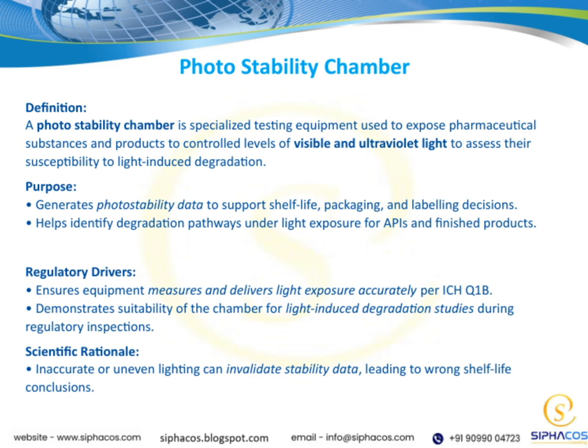These are crucial because they ensure our equipment measures and delivers the correct light exposure as specified by international standards, specifically ICH Q1B. During regulatory inspections, demonstrating that the chamber is suitable for light-induced degradation studies is essential. It reassures regulators that our data is reliable and our testing methods are compliant.